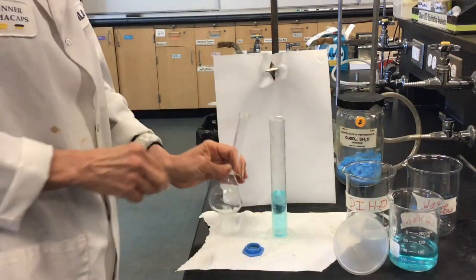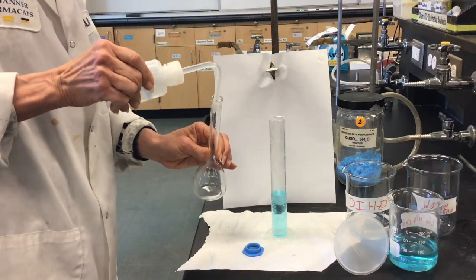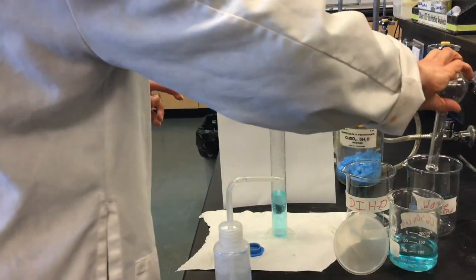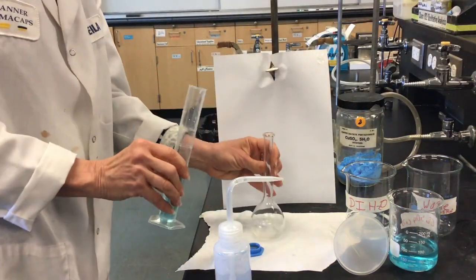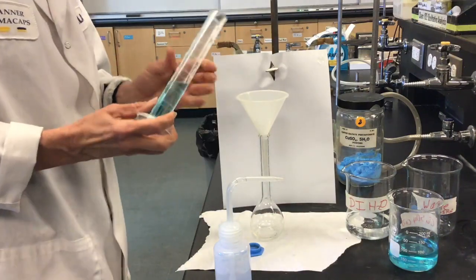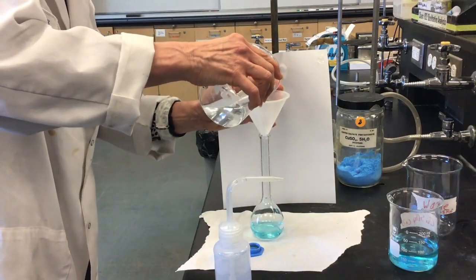Now we're going to be transferring it back into our volumetric flask, but I want to go ahead and rinse that out first so I don't have any concentrated solution left behind. So I do a little bit of a rinse here, dispose of the copper sulfate. Now I'm going to pour my concentrated solution back into my volumetric flask. Is at that 100 ml mark.